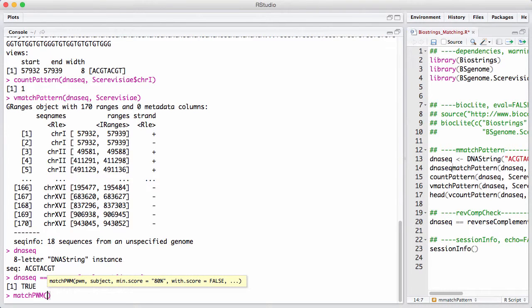For people in the know, a position weight matrix is also known as a sequence logo, or a transcription factor binding motif, and details a probabilistic representation of a short sequence. matchPwm allows us to search the genome, for example, for binding sites for a given transcription factor.